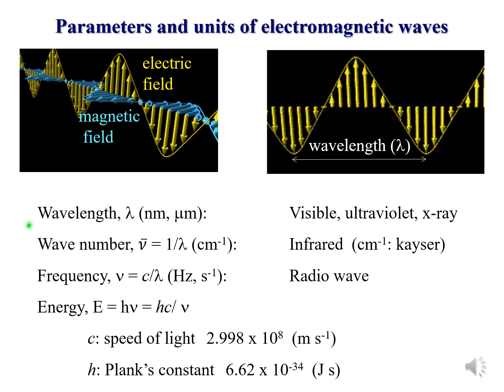Which of the characteristic values such as wavelength and wave number to use is roughly determined for each region of electromagnetic wave. Visible light, ultraviolet light, and X-rays are usually represented in nanometer wavelengths. On the other hand, radio waves are expressed by frequencies such as megahertz and gigahertz. Infrared light is represented by wave numbers in reciprocal centimeters.